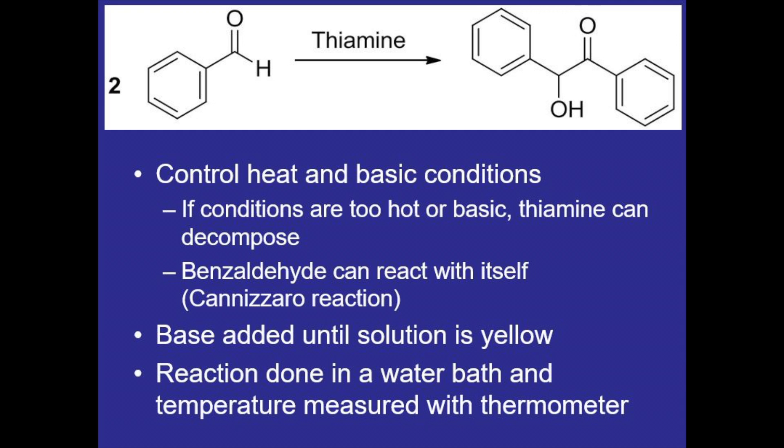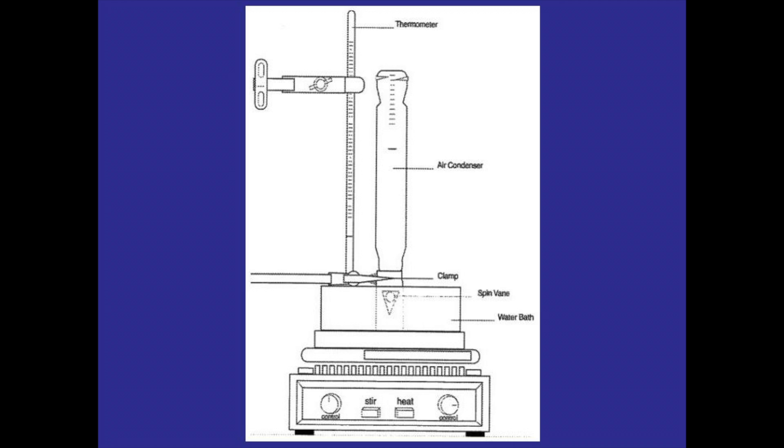We'll also do the reaction in a water bath and measure the temperature with a thermometer so the apparatus will look like this and we'll keep the temperature between 60 and 65 degrees celsius.